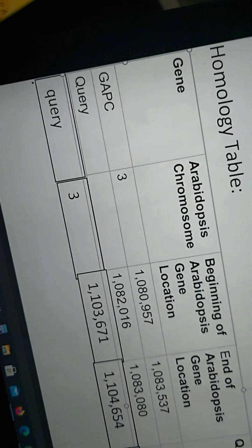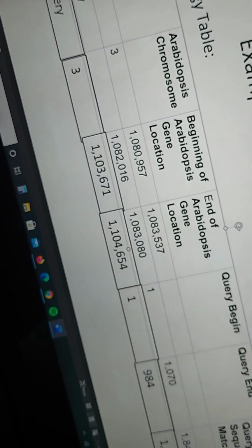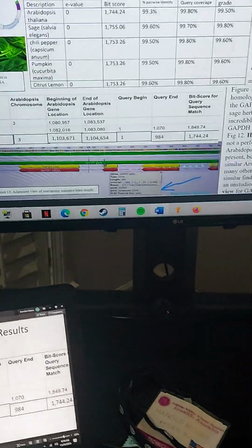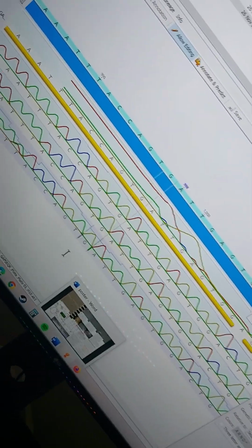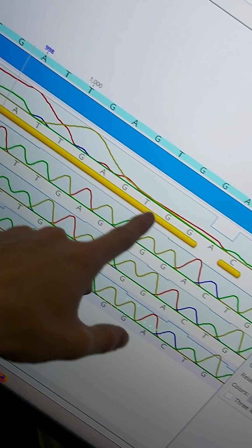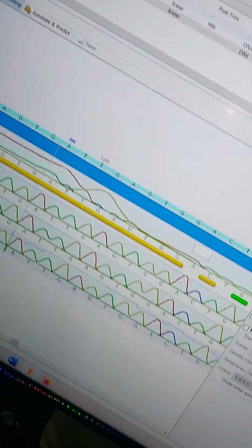This is actually a gene that within the Arabidopsis, it shows homology between my cloned cells and other people's cloned cells. But yet, Geneious actually did not recognize that, which I can show right here. If you pull up Geneious, see, these are the base pairs, of course. These base pairs, you can see that where it shows yellow, I had to modify those codes to make them more accurate. And that's by highlighting disagreements.